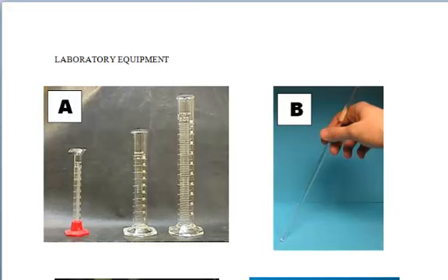This is just a quick video to show you some pictures of the laboratory equipment in case you can't utilize the maximum amount of time in class to look over the equipment before the quiz.